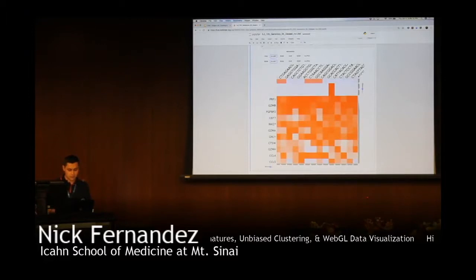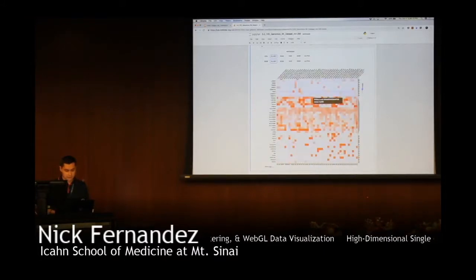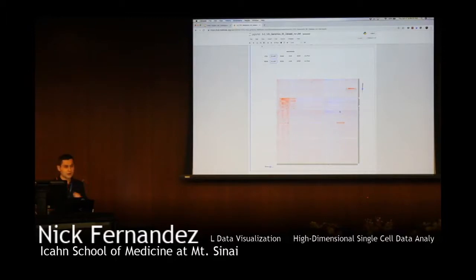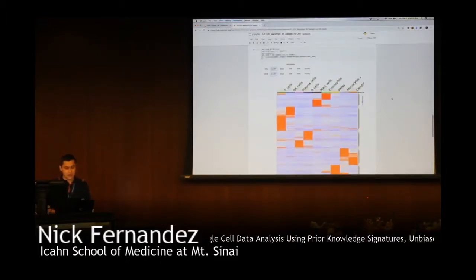So we can make some hypothesis of what the cell type is. If we zoom over here, we can see that these are high for HLAs, right? But this isn't that useful, because we could try and label the cells manually, but it's difficult, and we have like 1,000 of them, so it'll take too long. You can identify different clusters here, but unlabeled data is not that useful. So one way we can quickly label the data is by bringing in some prior knowledge.